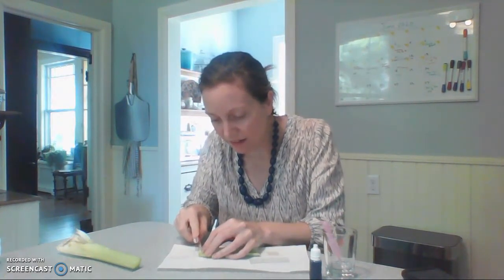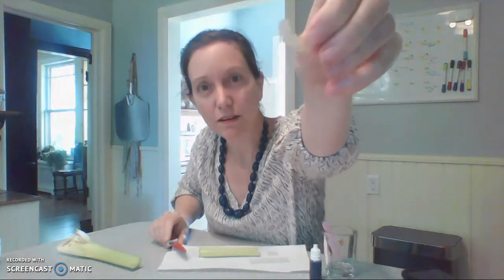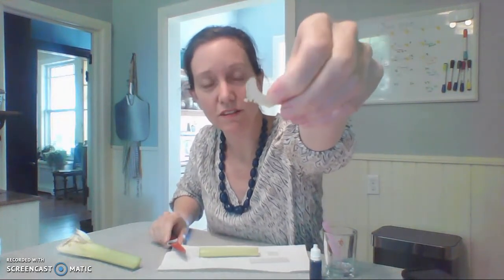So first I'm going to do a cross-section. I take my stem and cut it. I'm using a regular kitchen knife — a razor blade works really well if you have one. This is a non-serrated knife, which I prefer because a serrated knife leaves a wavy appearance when you cut into the celery. It may not be visible to your naked eye, but under the microscope it's definitely visible. So this is just a very sharp plain knife. Then I take a very, very thin slice through it.